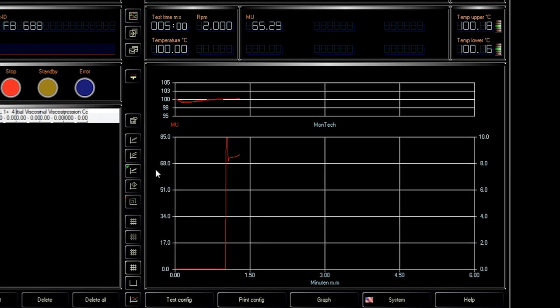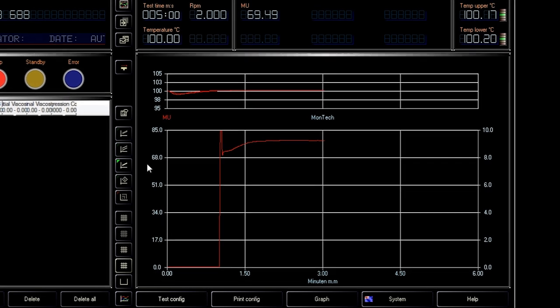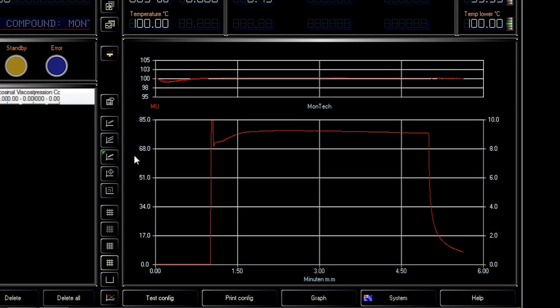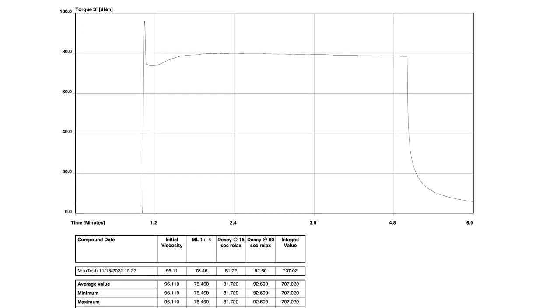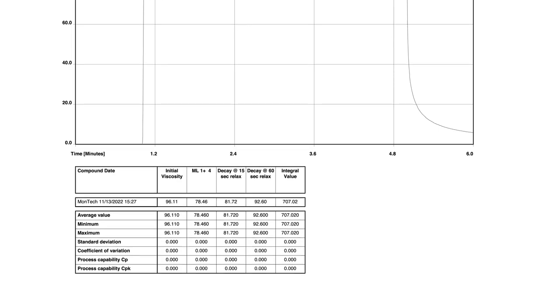Data from the test is displayed live in the software as the test is performed. Test results can be used to assess compounds, ensuring they meet quality control specifications and to compare with data from previous tests to ensure uniformity between batches or polymer shipments.